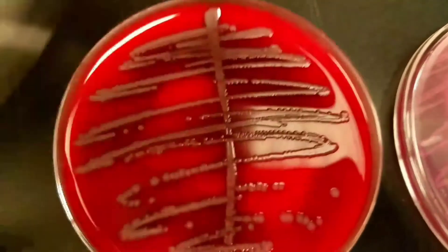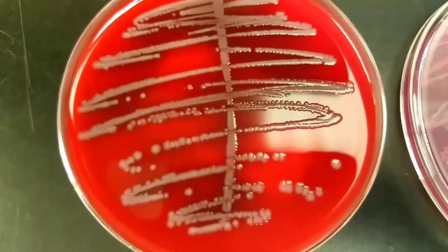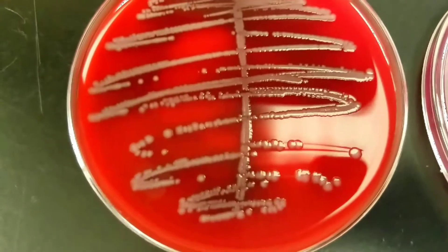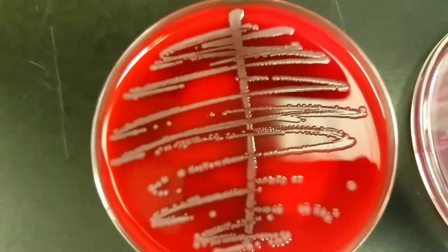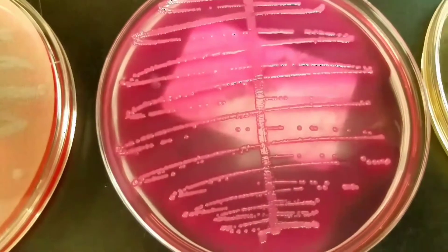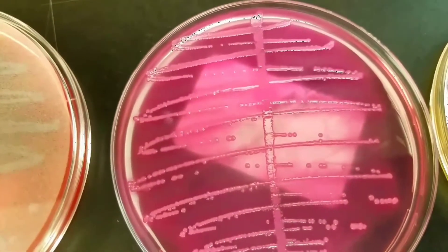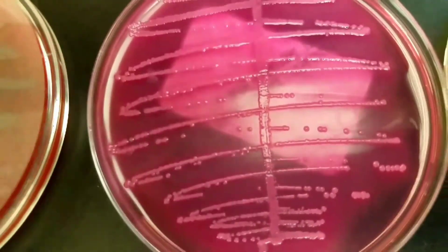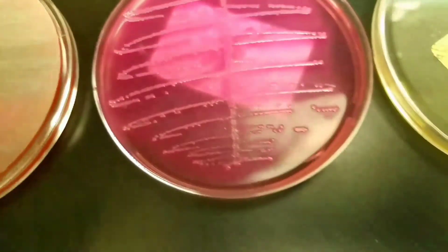Lastly, we have some really good growth on this one — a lot of that halo effect where it kind of eats around the agar and makes a darkening of the agar around the colonies. You can see that pretty well here on the MacConkey too — it kind of distorts the color and makes it a lot pinker. There may actually be two colony types, and it looks pretty mucoid as well.